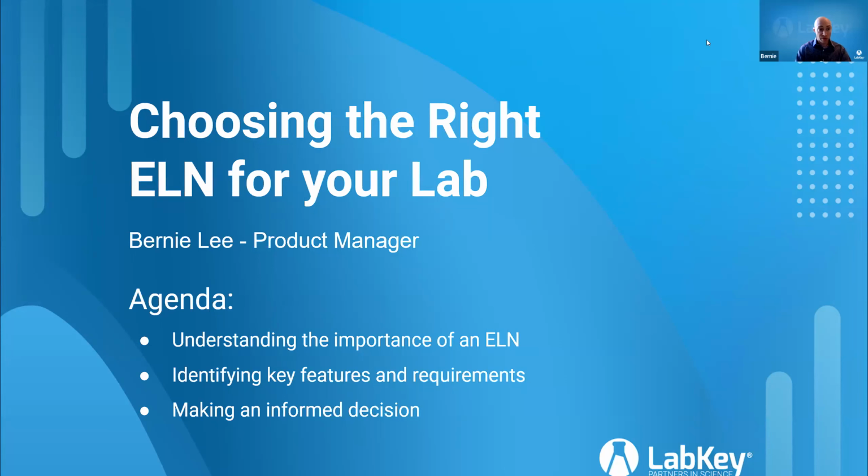We are going to focus today on a number of topics, starting off with understanding the importance of an ELN, what some of the differences are between their variations, of which there are many, identifying some key features and requirements, and then eventually how to go about actually making an informed decision.